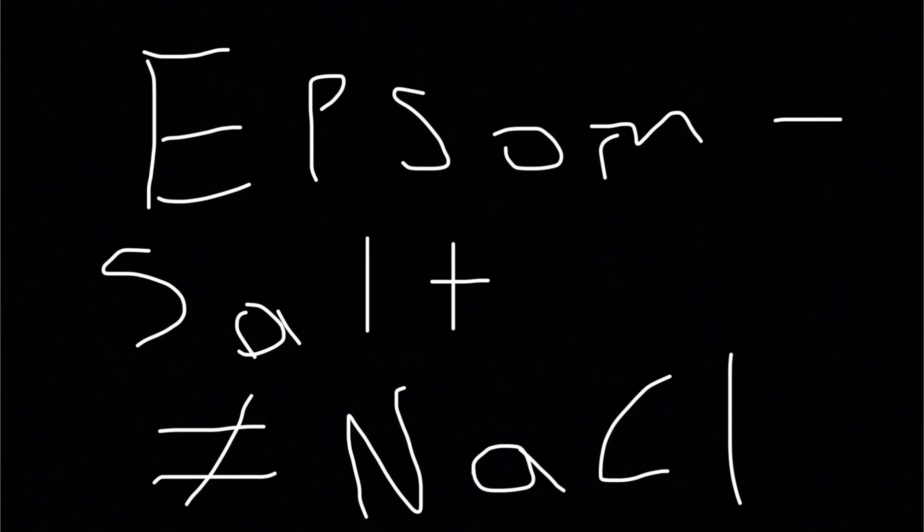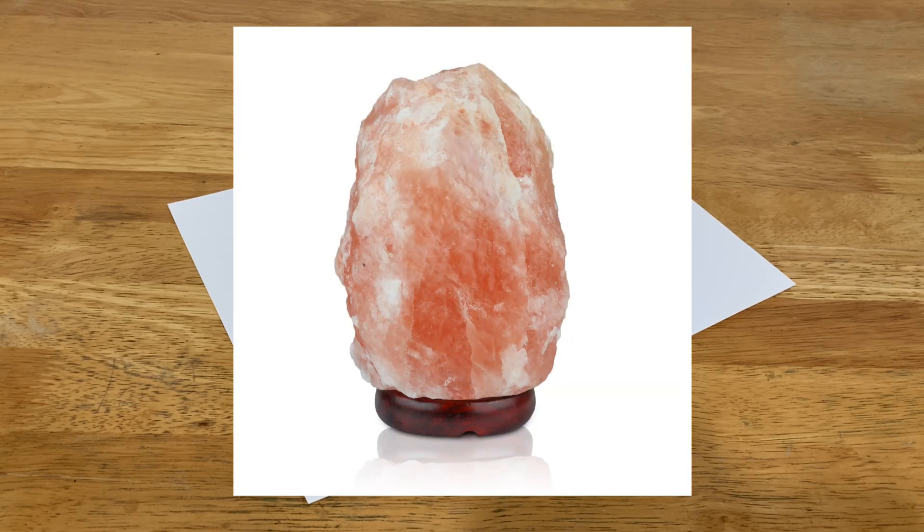Epsom salt isn't conventional salt — it's magnesium sulfate. So that means I can't eat it like I ate my Himalayan salt lamp.